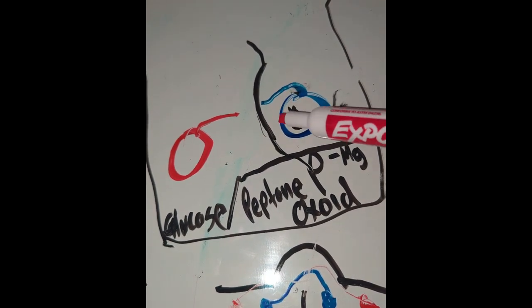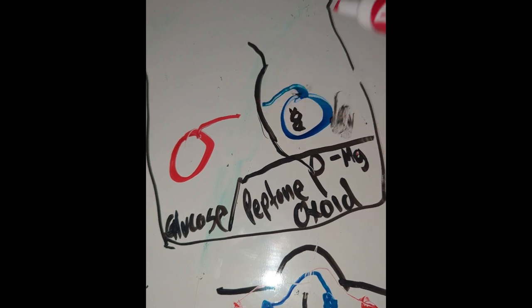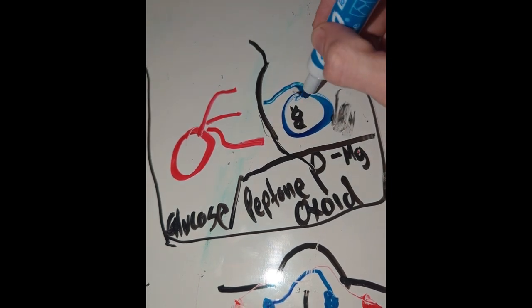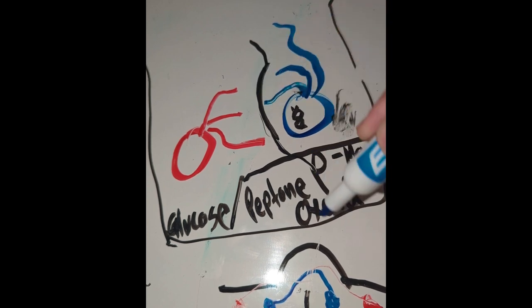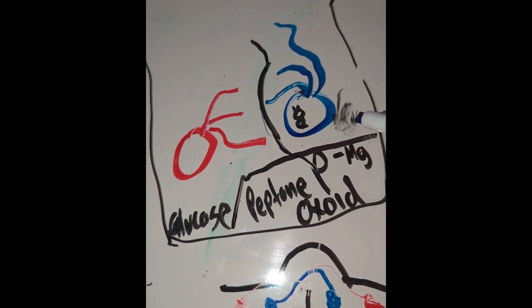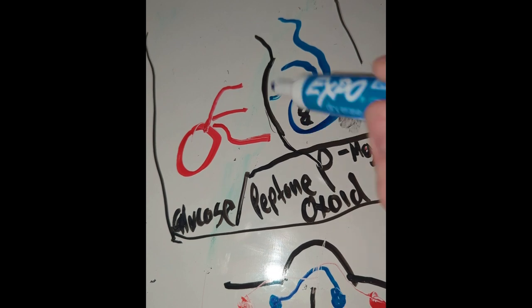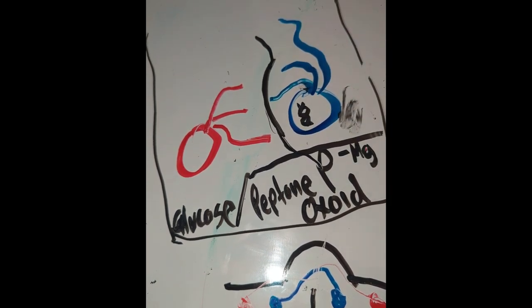This Peptone P and the low magnesium levels is going to prevent this. So when these cultures grow, they're just going to keep growing without having the ability to exchange their nuclei and share it. So when these cultures grow out, they could be reutilized for other breeding projects. And again, just a rough overview. There's more info out there.